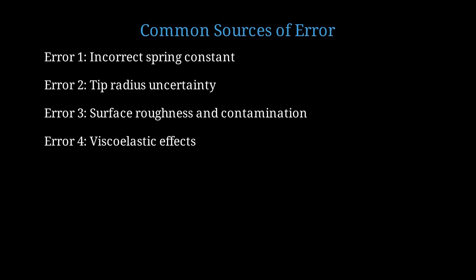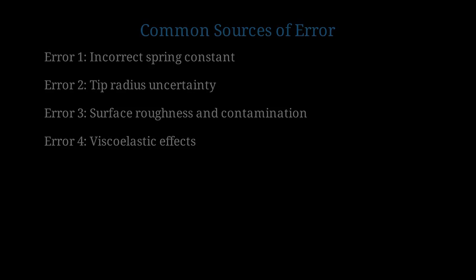Error 4. Rate-dependent effects. The models we discussed assume elastic behavior, but polymers and cells are viscoelastic. If you indent too fast or too slow, you'll get different apparent moduli. Control your velocity.